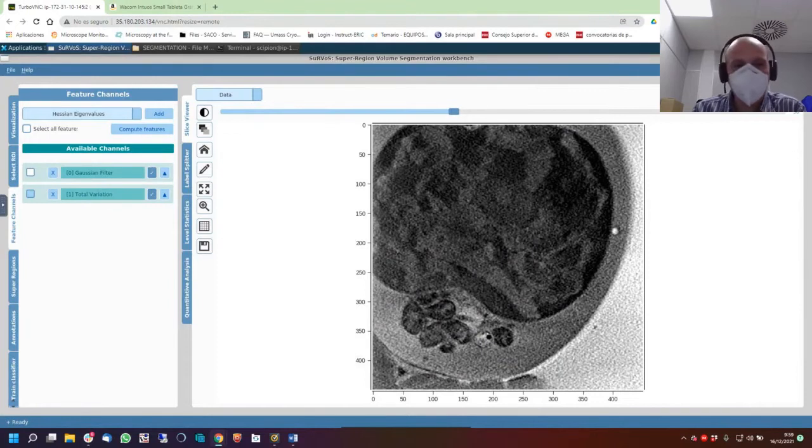Javier. Yes. One question: do you know, because there's a similarity to what we do in image processing, we do segmentation to identify vesicles, basically membranes. Yeah. And I guess the software has some ways to do the same thing. Yeah, it is. Do you know if there's a way to interact with SURVOS? So are these filters available through command line, or?